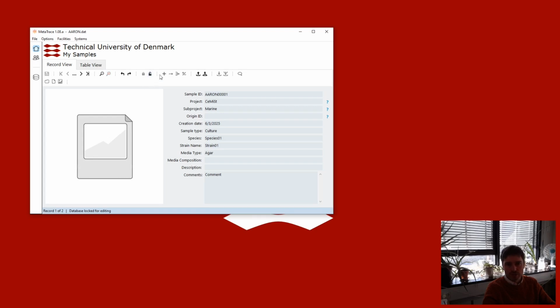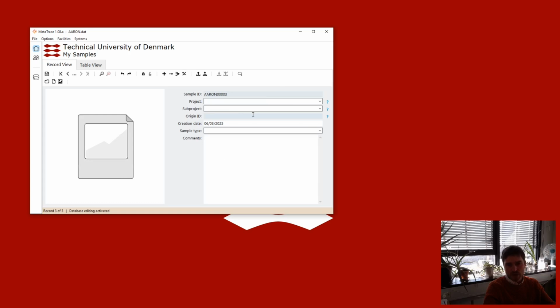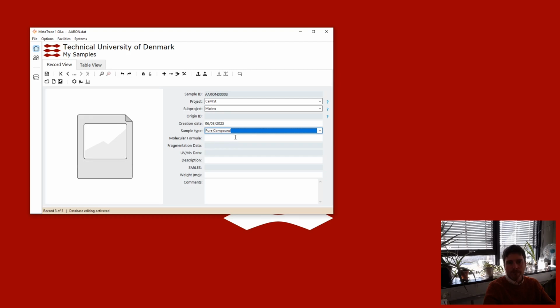Yeah, so that's unlocked. These here are sample creations. So these are new record creations within your own database, these 3 here. This is just creating a new blank record, so we can have a look at that. It just simply gives us a new clean blank record, and we can do whatever we like here. So therefore there is no sort of origin ID in this case. So this is something that's just come from nowhere, essentially.